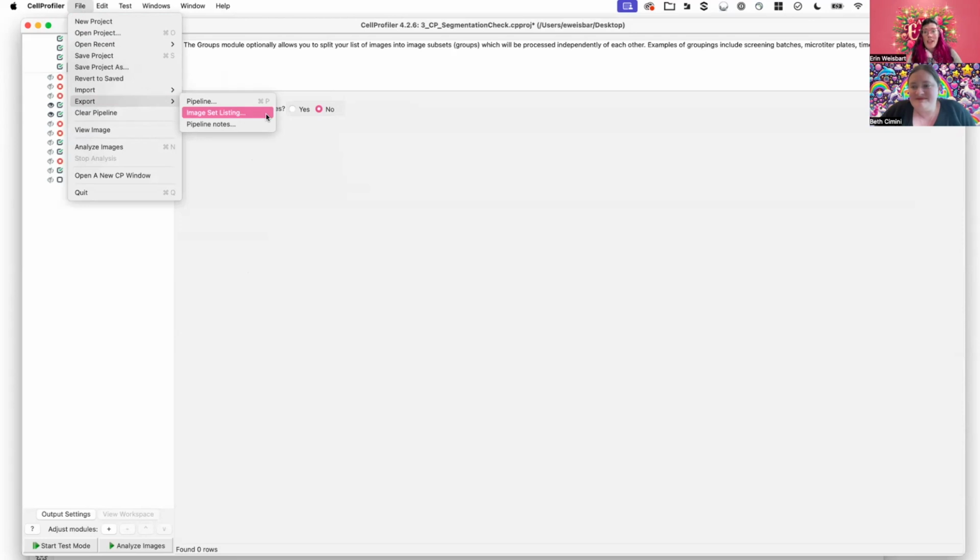That is a great reminder. So this is what it looks like to do that. And as Beth mentioned, we have tons of public examples. Everything in the Cell Painting Gallery uses or includes LoadData CSVs for those images. So I'll drop some links in our show notes to examples you can go look at for existing datasets, to help orient you further.